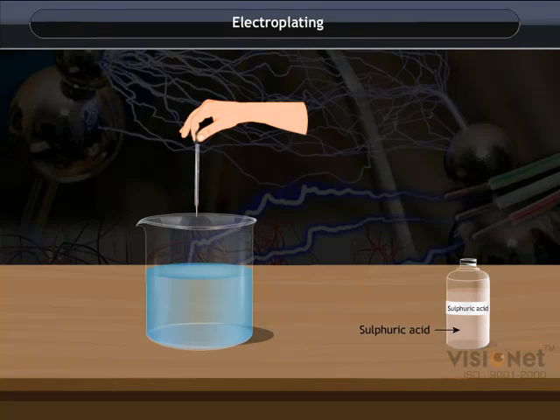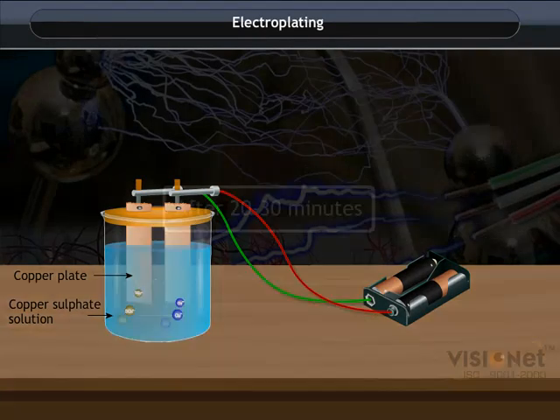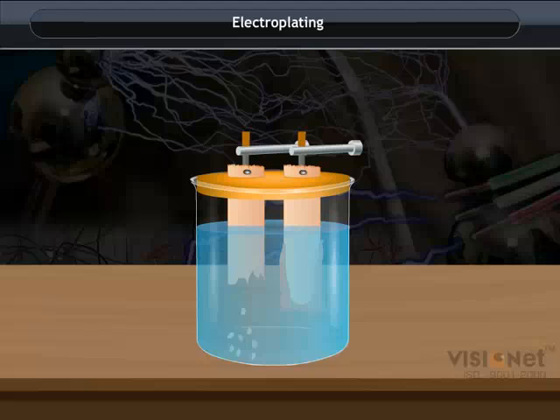To make the solution more conducting, add 2 to 4 drops of dilute sulfuric acid to it. Immerse the copper plates in the solution and connect them with the battery. Allow the current to pass through this setup for 20 to 30 minutes.